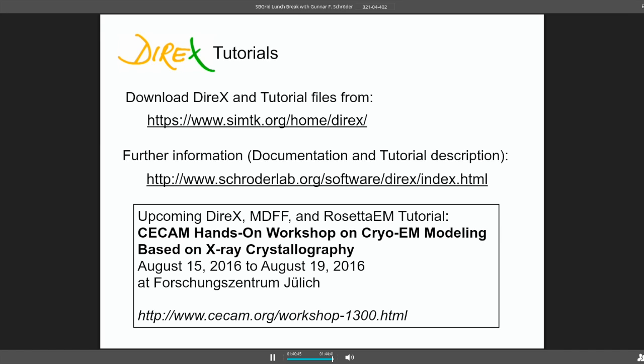From this we can determine a normalized C-free value that gives you a more absolute measure. I think this will be very useful, but it is not implemented at the moment, and we are still working on that. So this will hopefully be the way of doing this in the future.